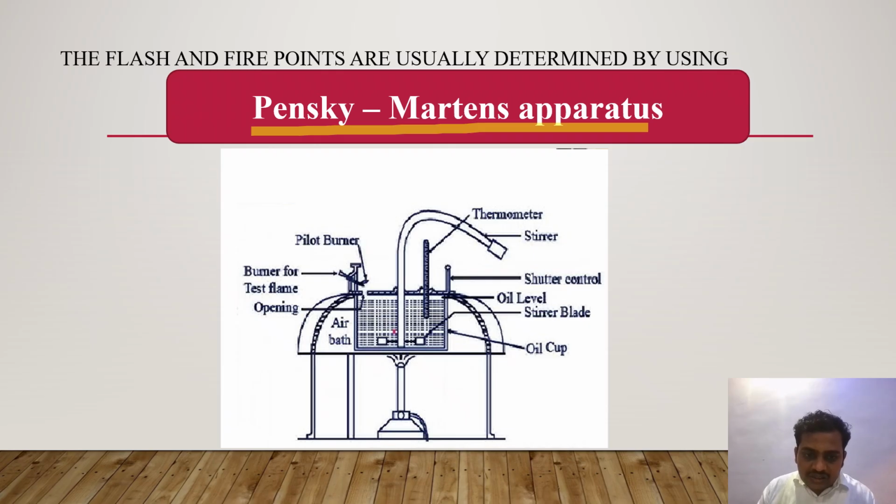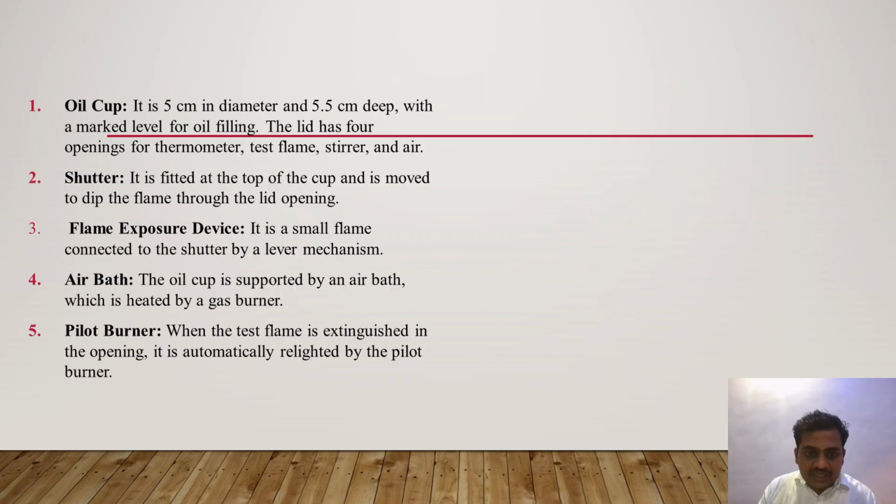If you see, there is the burner which is used to raise the temperature of that oil. The pilot burner is there, the test flame is there. So this whole setup, which is the Pensky-Martens apparatus, is explained in this construction.